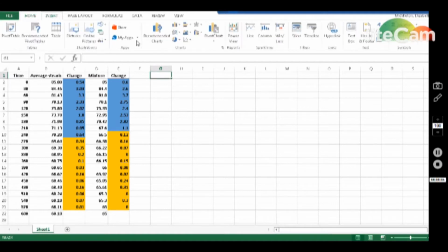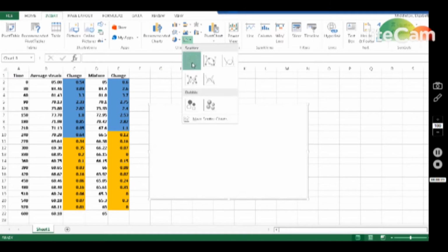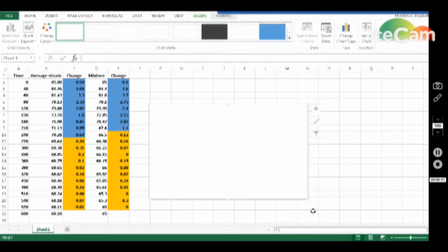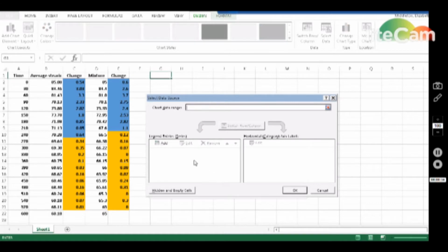We have the Insert button, and then there are several different chart types we can choose from. Now the layout of your particular Excel may be different depending on the version, but you should have most of the same options that you're going to see here. In this case, we would like to select a scatter plot, and we want to select one with dots that are not connected by lines. This is going to give us a blank chart, and we're going to add our data.